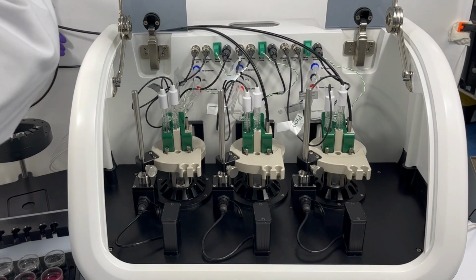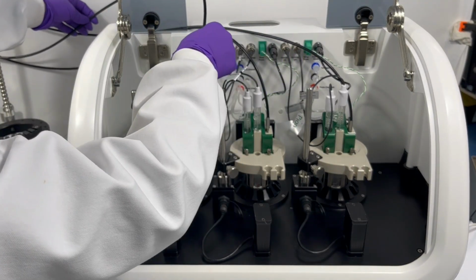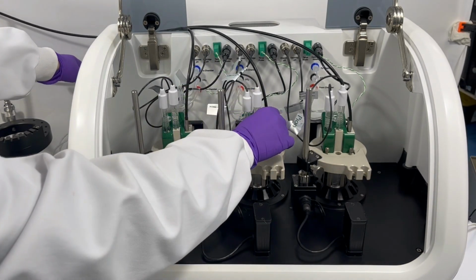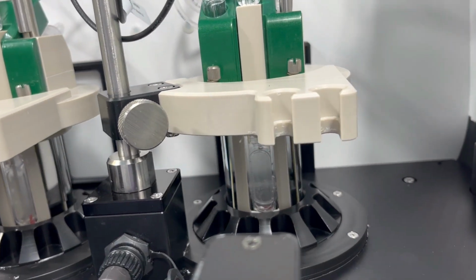So we can see here, just pulling the SCISSOR fiber optic probes through the back of the system and out into each of the chambers. There's a very small designated port for each of these fiber optic probes in the lid of the chamber.